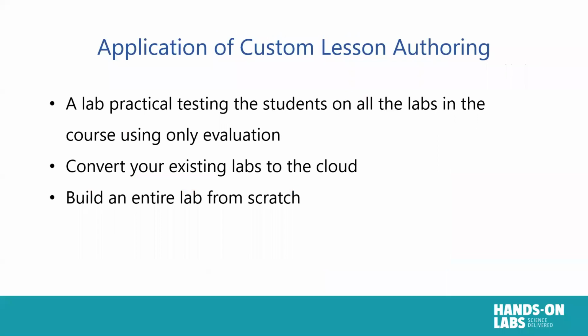So we've gotten to the end, and the question you probably have now is, what is the application of this, and why would you want to use custom lesson authoring in comparison to just using what HOL has? I like to look at this as a tool that you can use hand in hand with all the experiments you have in the HOL library.